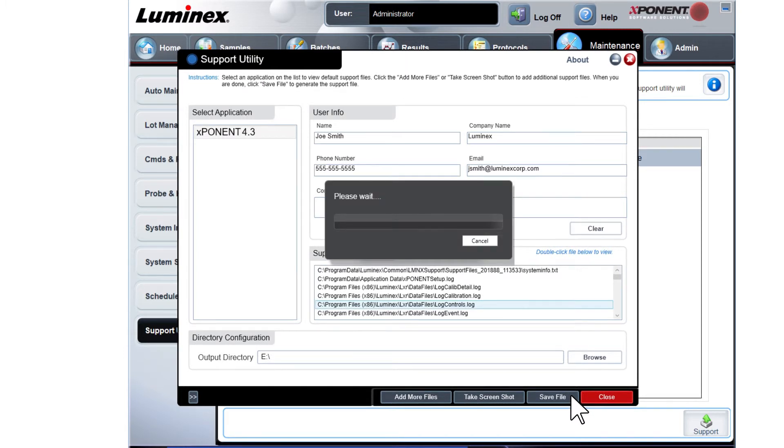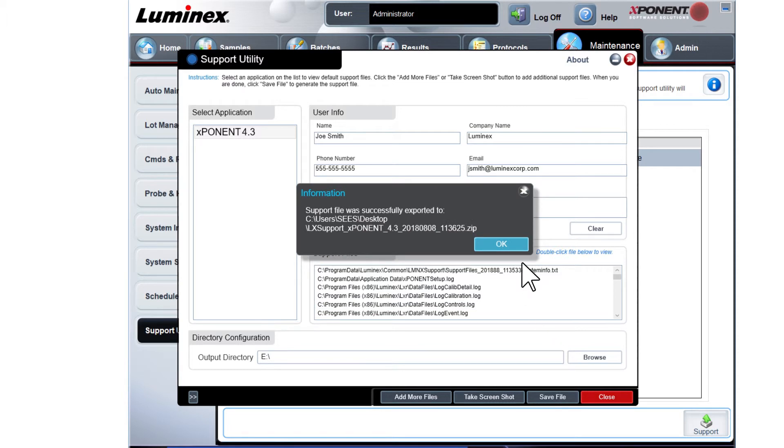After Exponent has finished polling the required information, a window displays indicating the export is complete.